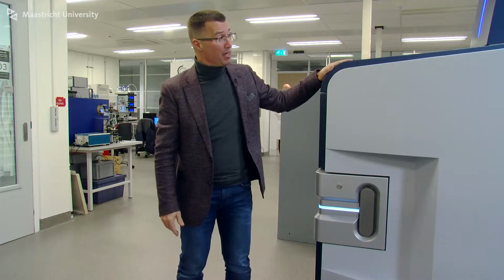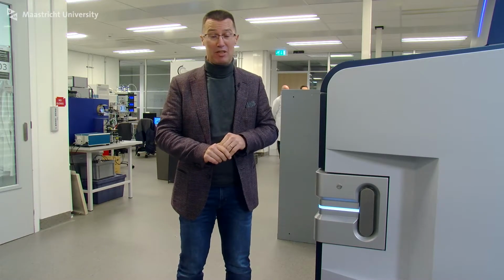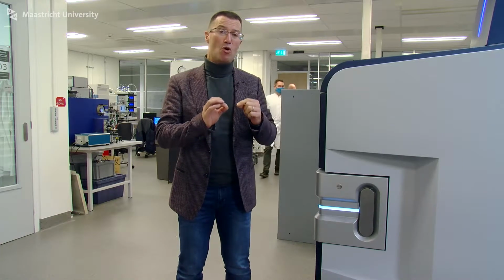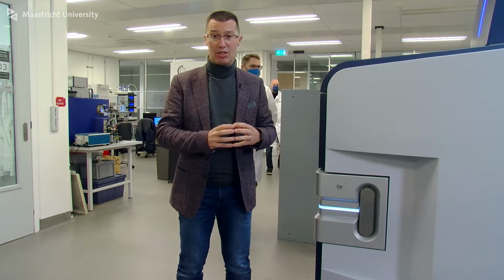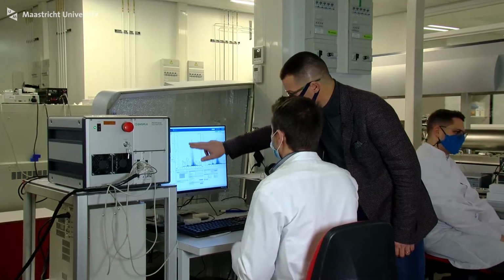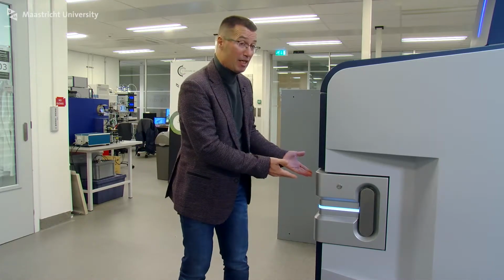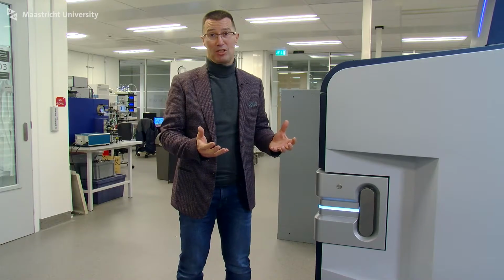So, welcome here in the labs of M4I. And you are surrounded now by all different high-tech imaging mass spectrometry systems. Every single instrument you see here actually is a molecular microscope. So next to me here is our timsTOF Flex, and this is our latest and greatest high-resolution molecular imaging device, and that allows us to even more efficiently generate molecular images, where with very small pixels we can understand this molecular complexity. Whether it's a hair, a biopsy from the clinic, a piece of tissue, we can all put it in here and generate these gorgeous molecular images.